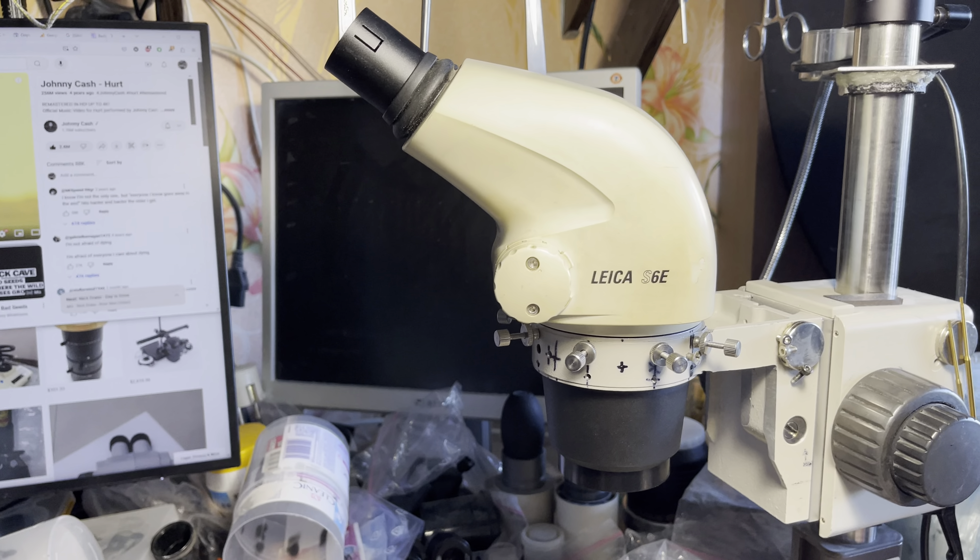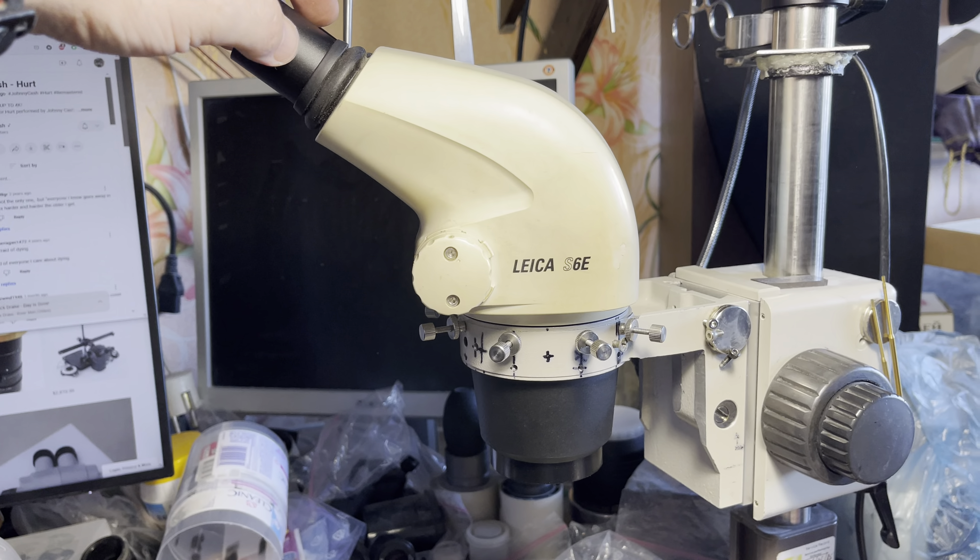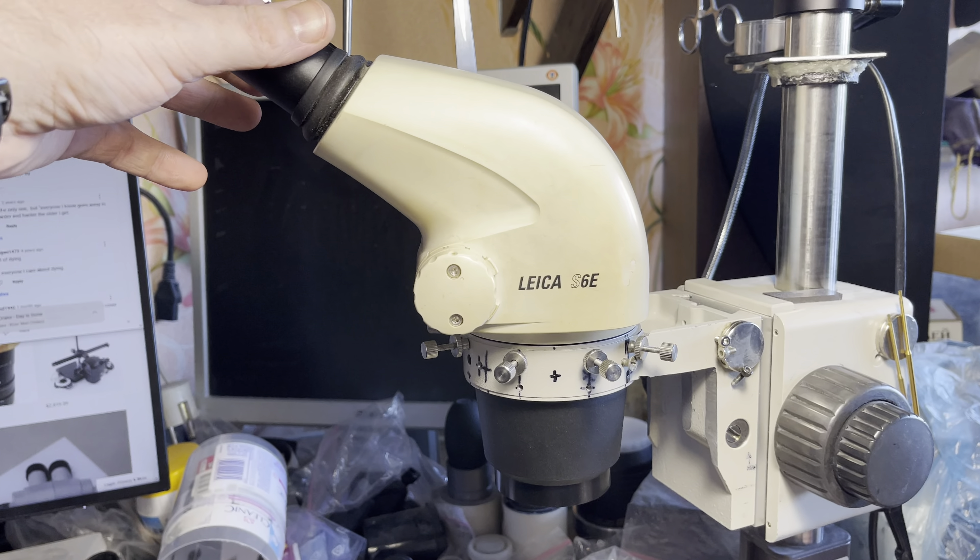Hello everybody. Now it's time for us to get a deeper look at the Leica S6e — let's look at how things are made inside. I prepared for you another already-open Leica, so let's carefully look at what we've got in here.